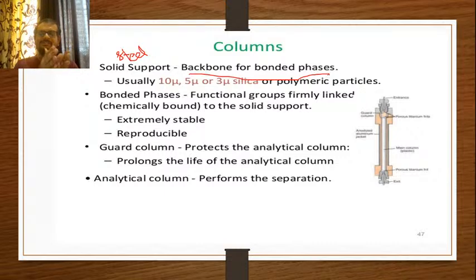Okay, जो stationary phase रहेगा आपका, उसके लिए ये backbone की तरफ पे act होंगे. Usually 10 micrometer, 5 micrometer, 3 micrometer silica or polymeric particles have been used. Remember, smaller the particle, better is the resolution.